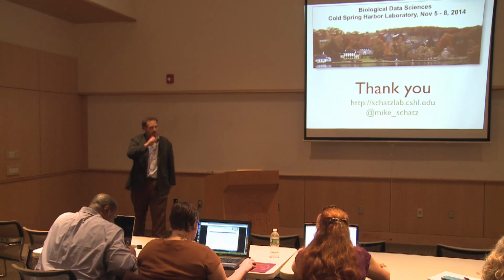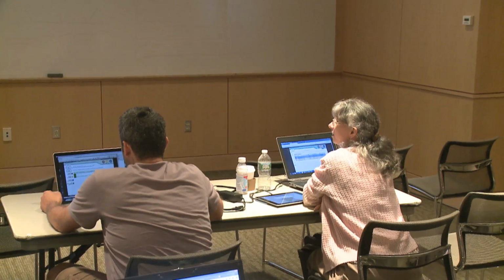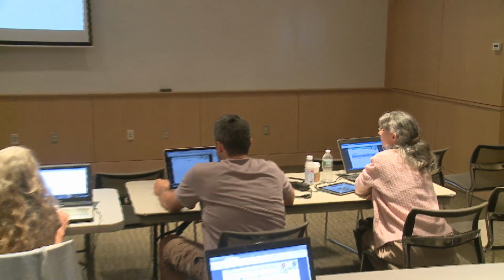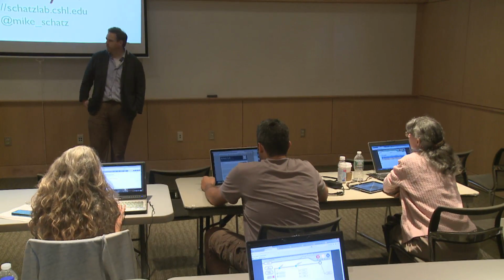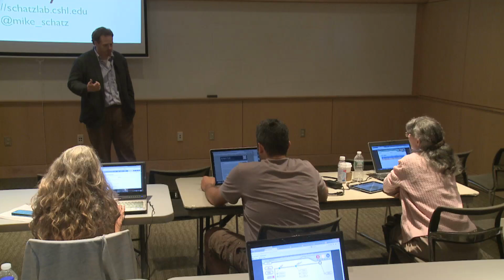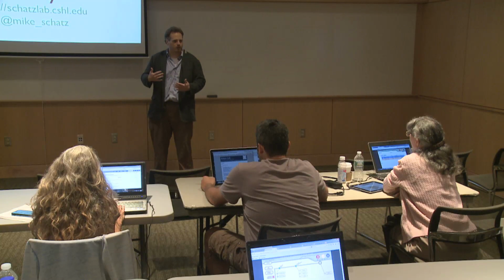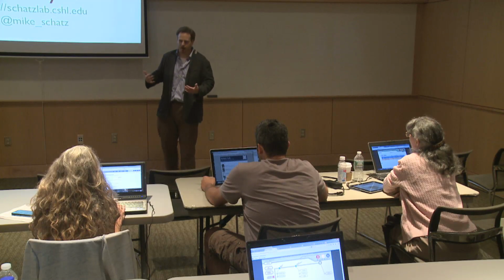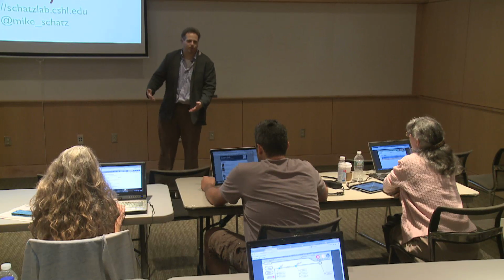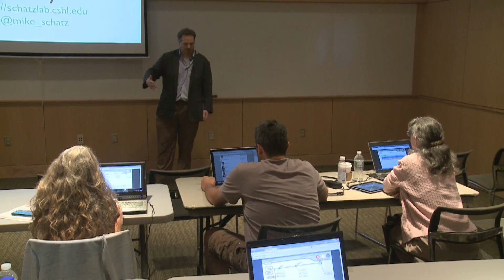Other questions? Yeah, my traditional question: what about transcriptome analysis? Yeah, so the concepts are very similar. The actual software that you're going to use, the hands-on, will be quite different. As I hopefully explained, genome assemblers use coverage as a really important clue to determine where repeats are versus what is unique, what is reliable, what is not reliable. But in a transcriptome, your expectations on coverage are just so different, because of this wide dynamic range of what's available.